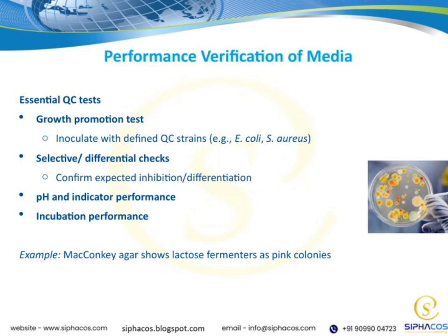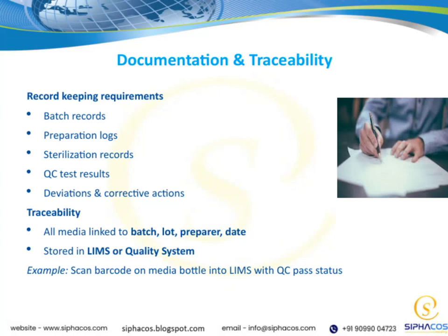All of these steps together help us verify that the media will give reliable and consistent results in our testing processes, supporting the overall integrity of our quality control system. Let's talk about documentation and traceability.